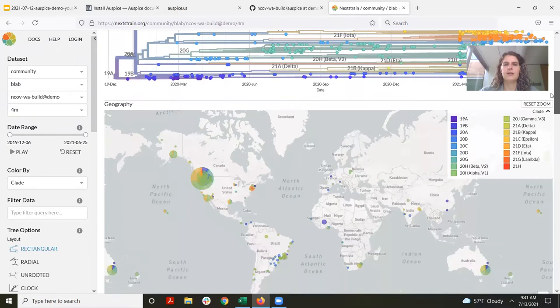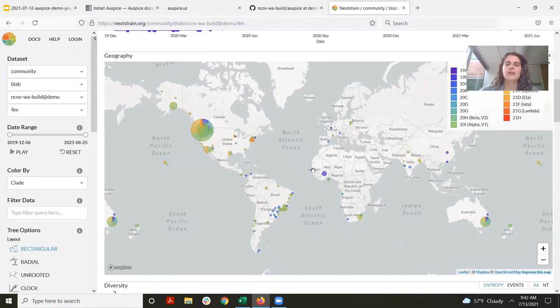The next panel is the map panel. On this map we have circles showing where each of the samples in the tree came from, and the size of the circle represents the number of samples in the tree. Because this is a Washington state-focused tree, we have a really big circle over Washington state.